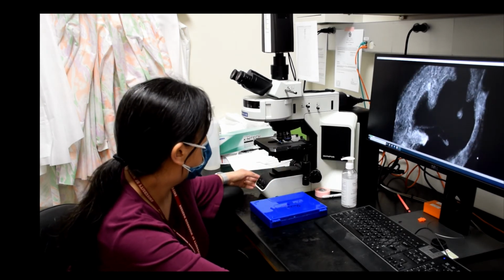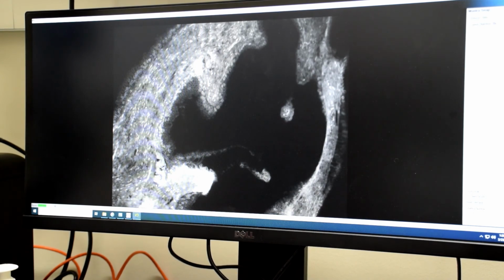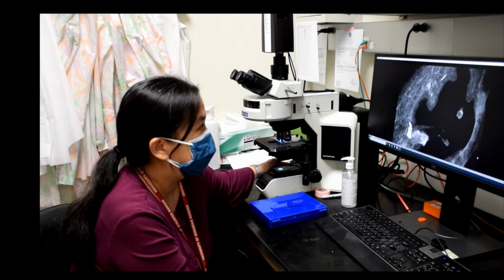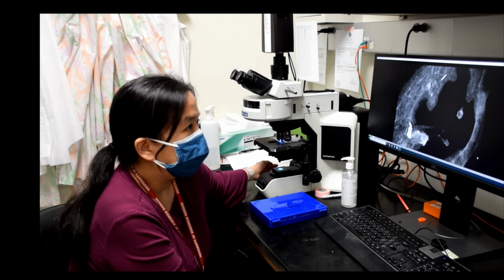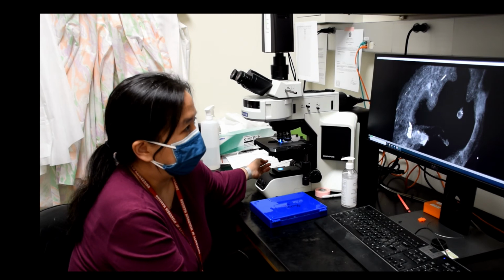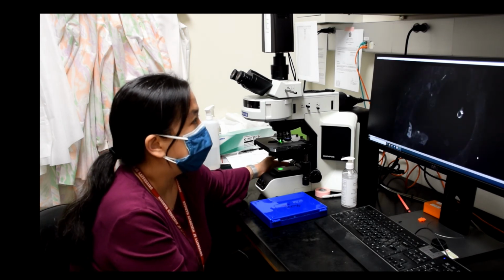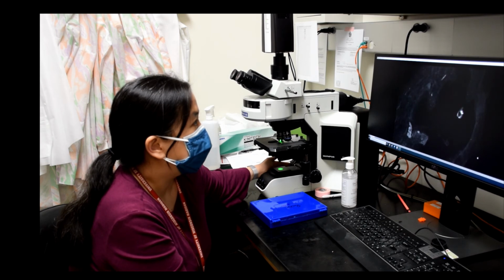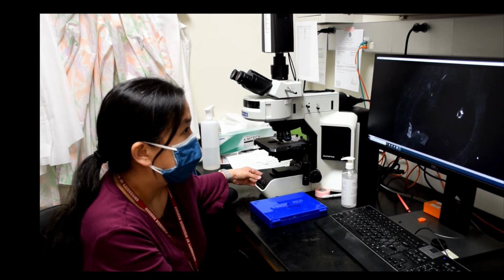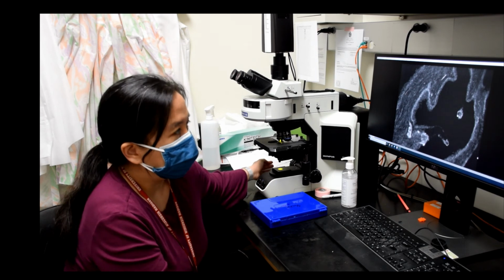So with this microscope, what you can do is look at the different channels to see different proteins. So this is a prostate tissue, and we can cycle through the different filters to look at different colors. So this is the nucleus, or the blue channel, and then we can change the different channels to look at different fluorescent proteins. So in this channel, we are looking at the green, or what some people call the FITC channel, and so you see the image on the screen looks a little different than what the nuclei looks like. And then we have a red channel, so this one is called Cy3, and so you can see here this protein is less abundant than the other proteins before. And then we have a second red channel called Texas Red, and you see again the pattern is slightly different, and then as we focus in and out, you can see the different patterns.